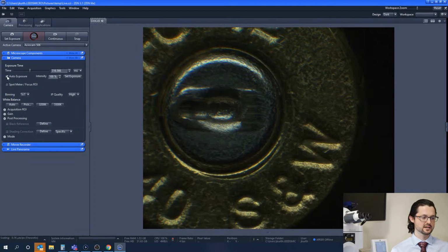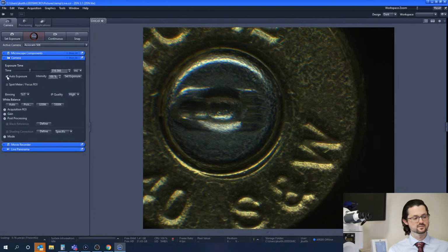In this mode, exposure looks at the camera, so everything you can see here, and it looks at the intensity part. Here, that intensity part is 100%. And in the software, the way I understand it, it's saying, okay, no pixel can pass 100% exposure. So that's the limit for the exposure. It looks at the frame, says go past 100%, limits that.